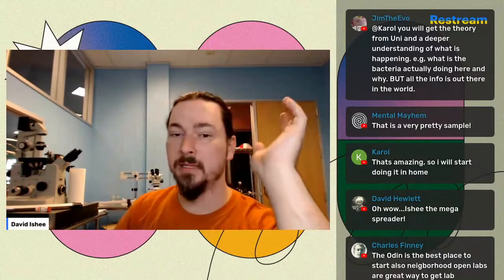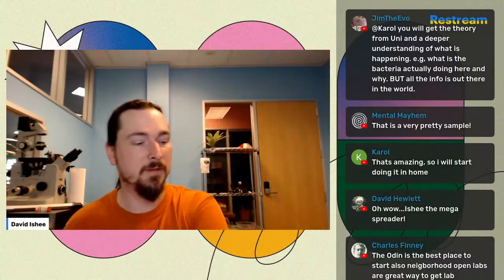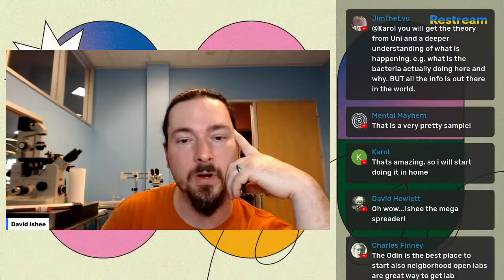Now, currently, it only really works with the leaves. And we haven't tested in a whole lot of species. I've tested other things in the nightshade family. Tobacco is a nightshade plant. So that's also potatoes, tomatoes, peppers, all sorts of things. My hope was that if it works so well in tobacco, maybe it'll work so well in tomatoes and potatoes and all these things. So I tested in peppers and tomatoes, and I didn't get any to work.